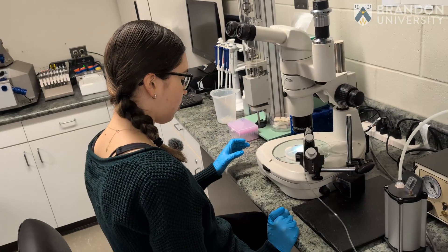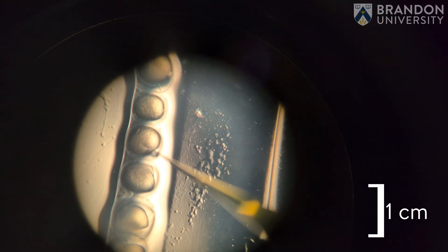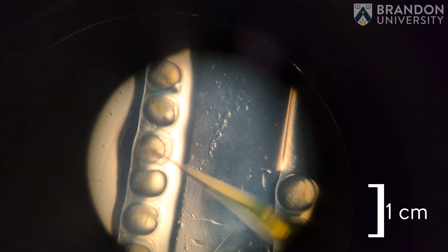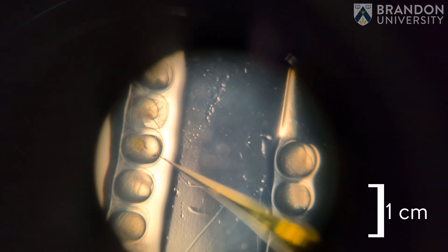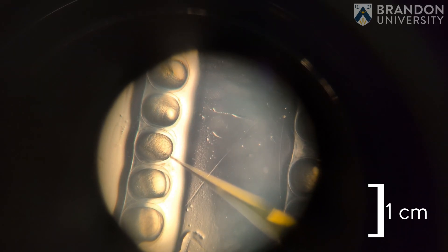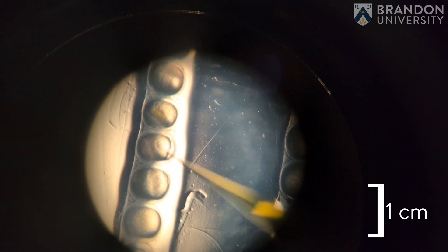First I have to look under the microscope to make sure that my needle is just above the embryo, then with my hand I'm going to insert the needle into the embryo, press on the pedal, and then retrieve the needle out of the embryo.